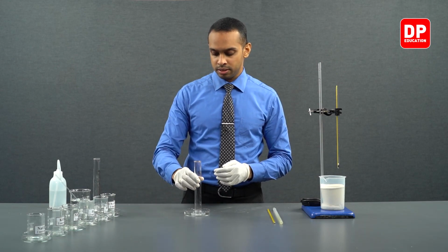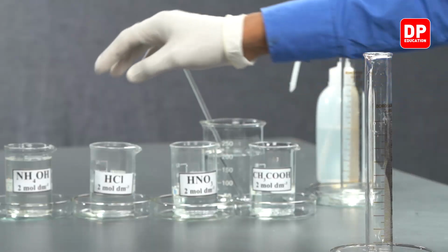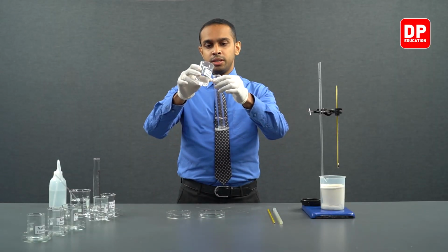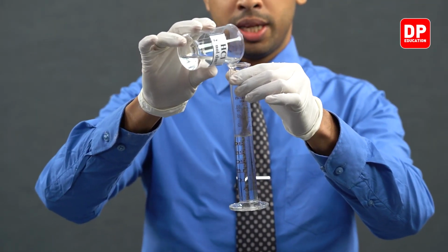We'll take our measuring cylinder here, and we have our hydrochloric acid, and let's measure 50 milliliters of hydrochloric acid.